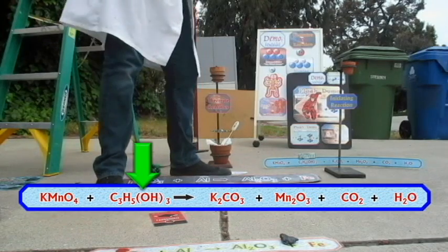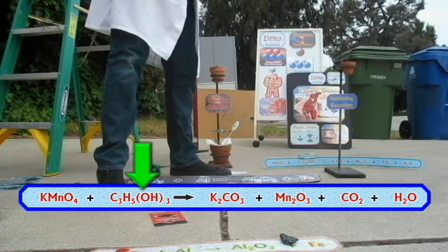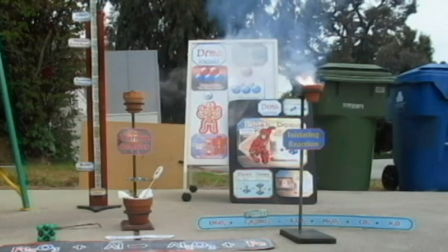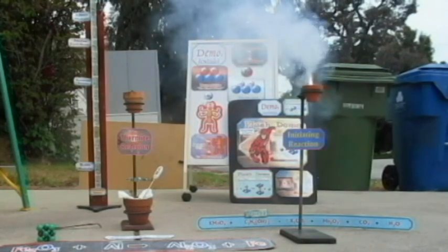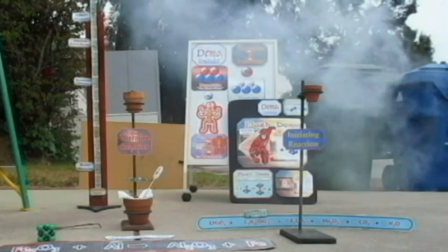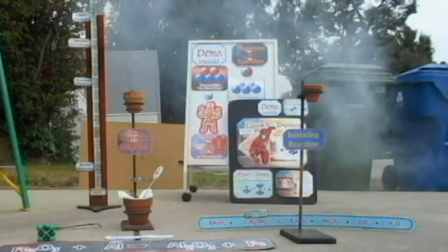This should start off a pretty flashy reaction. Quiet. There it goes. There's the initiating reaction. So now notice it's smoldering, but it really didn't do all that much. That's kind of what I expected.